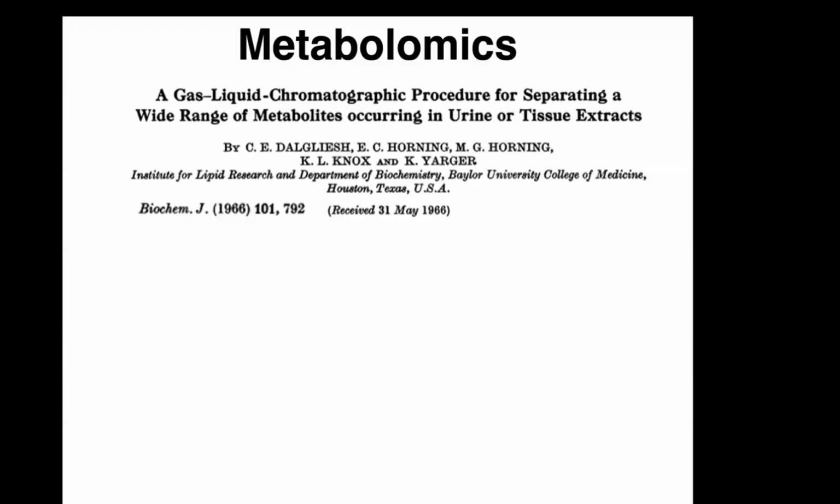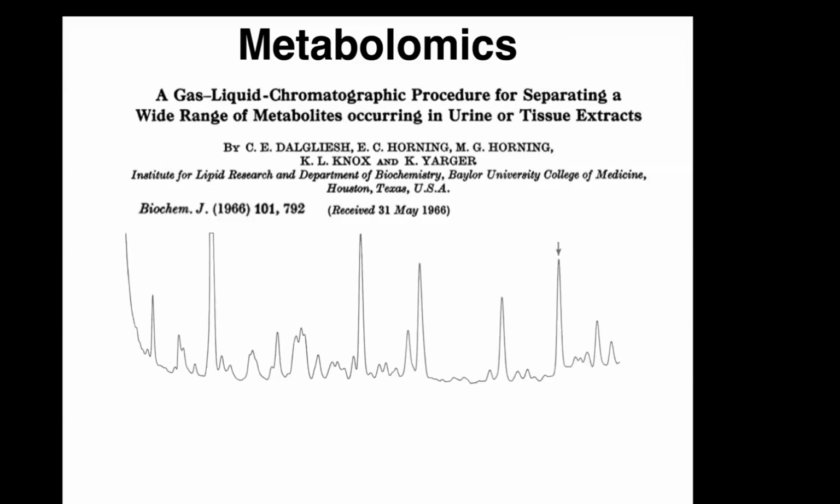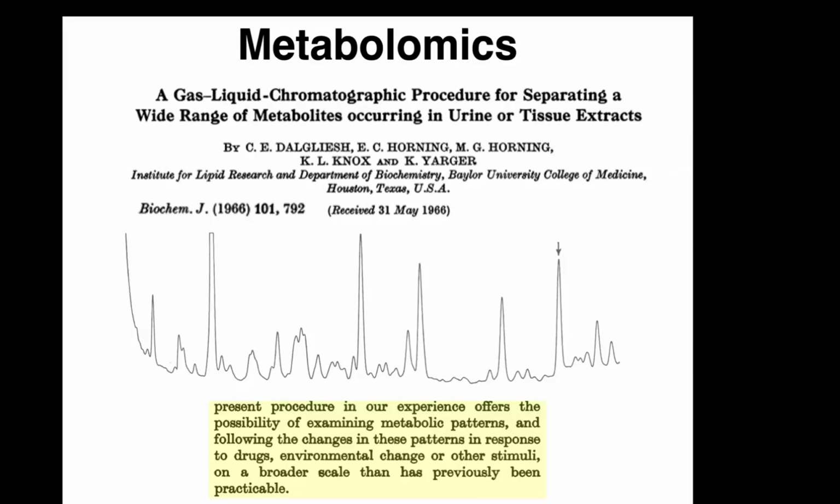Ultimately, one of the bottlenecks in what we're trying to do today is identifying what these molecules are and statistically assessing the differences between them accurately. One thing that I touched on last week is that, surprisingly, almost 60 years later, we're still challenged with the very reliable identification of these molecules. So it's not been a trivial process. And again, this sentence from the abstract of this paper largely describes what we're trying to do today. Again, this was roughly 60 years ago.